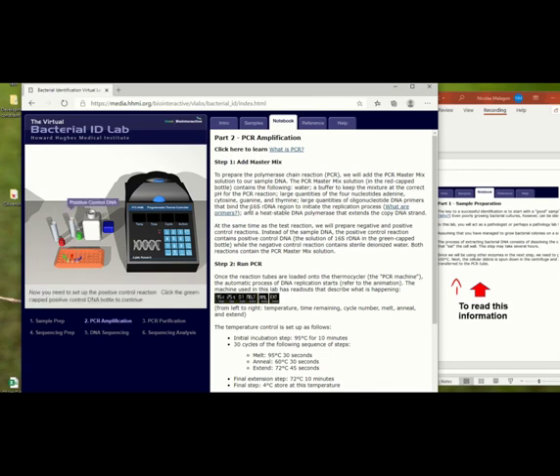And here you can read more about the master mix solution. Now as I click the green cap, so now this continue.